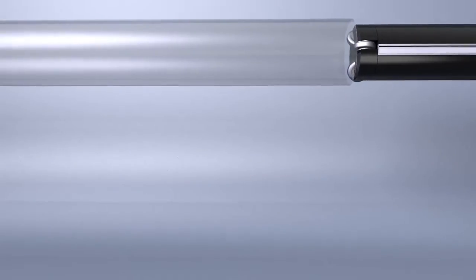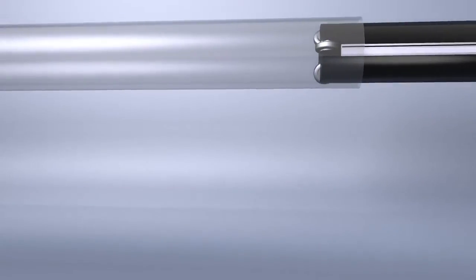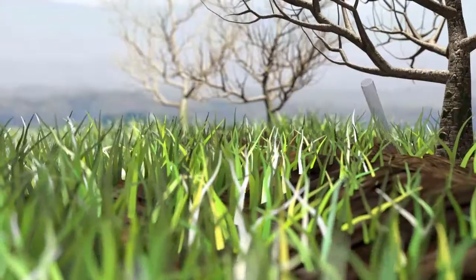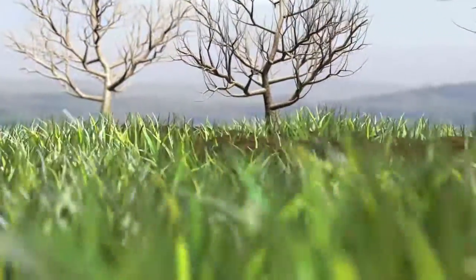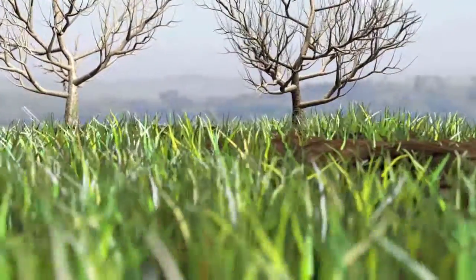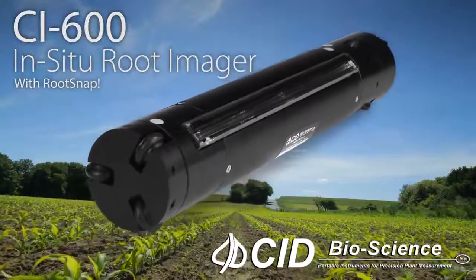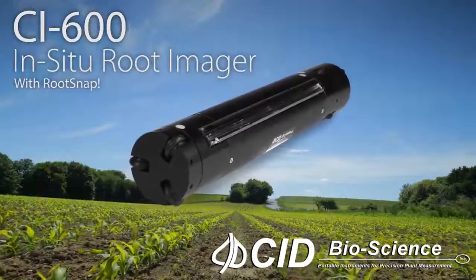In conclusion, the CI600 is the most efficient, non-destructive way of observing the rhizosphere in action. Most growers will only need one CI600 scanner with multiple root tubes to paint an entire image of their crop. Take the guesswork out of root management with the CI600 in-situ root imager with RootSnap.